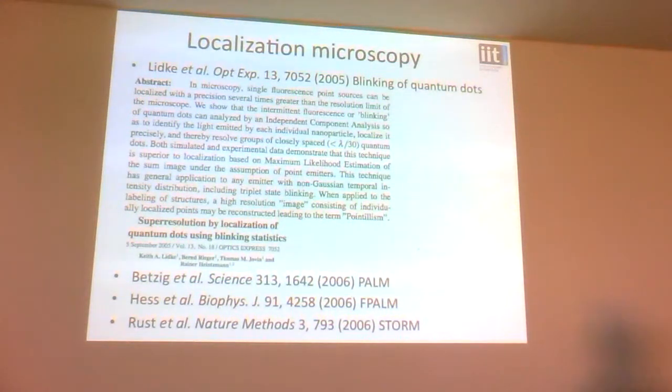So basically the quantum dots are flashing on and off, and then you localize one and then another and so on and so on.